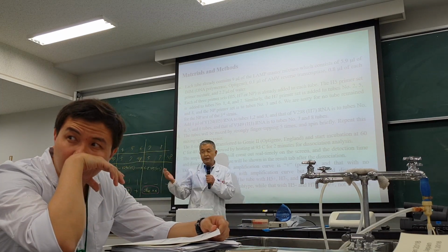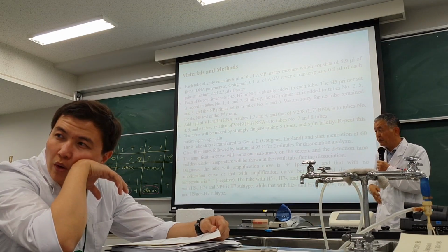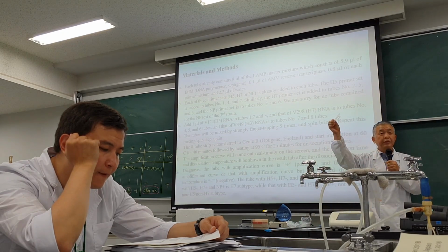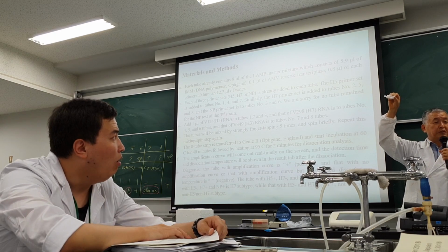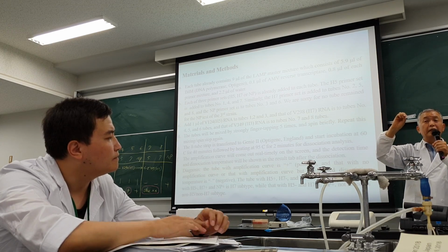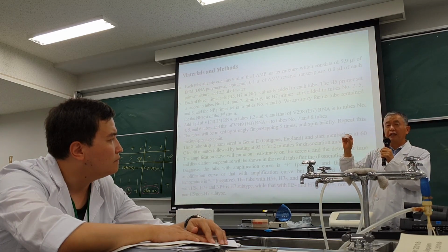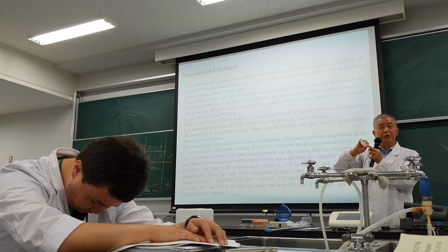So in here, after adding the 1 microliter of RNA sample, and before that, I have to explain. The strip, okay, is specifically produced by the company. It has a cover, and also there's some stopper at the top. It's difficult to explain. Anyway, turn and push, right?